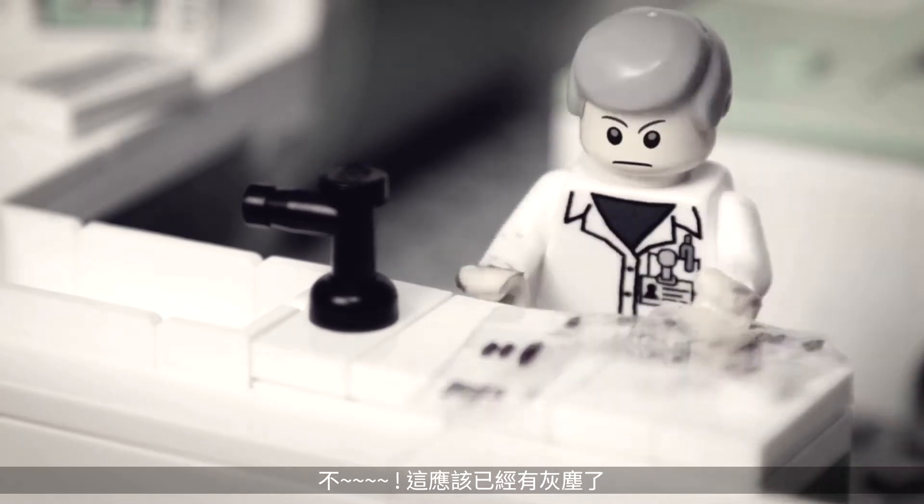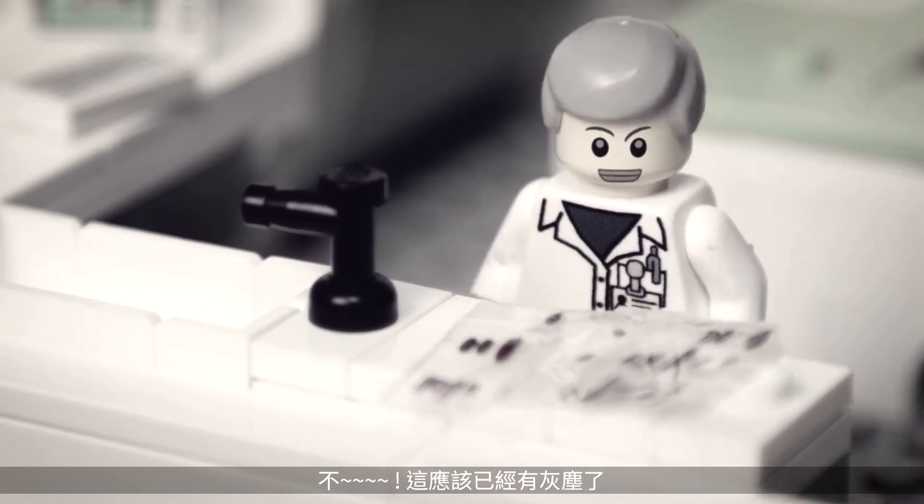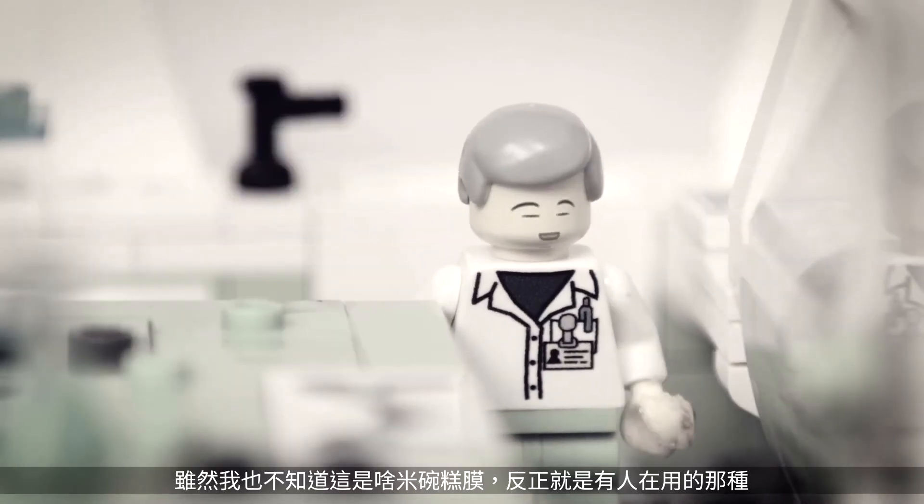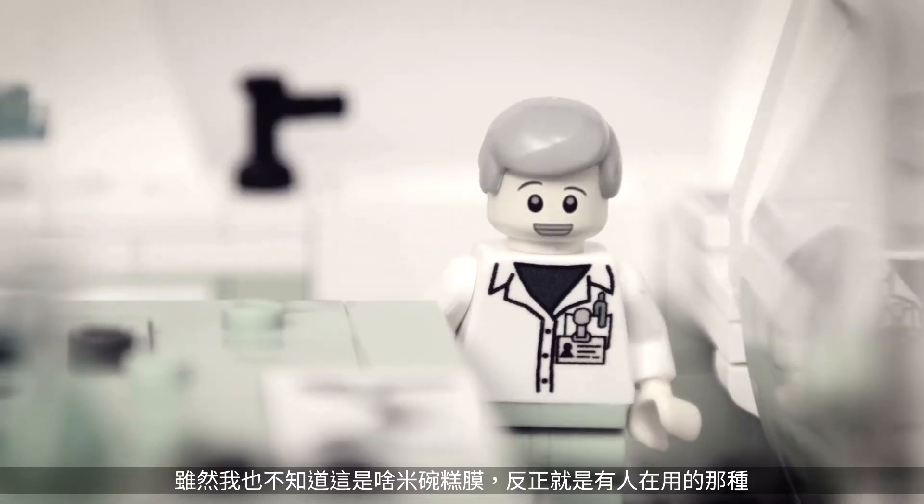Well, I guess there'll be some dirt on this one. Let me get the transfer membrane our lab always uses. I don't know what kind of membrane it is, but it should work, right?